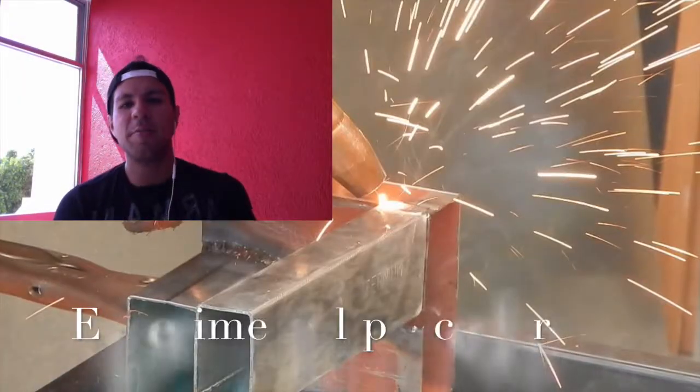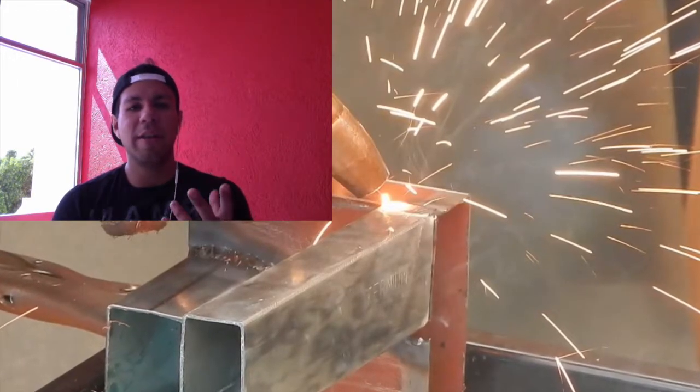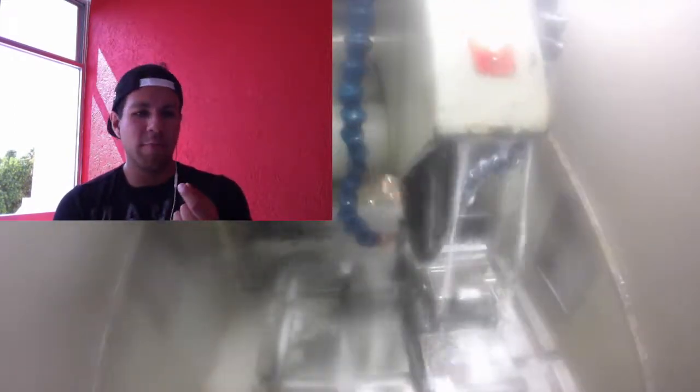The objective of this practice is to analyze the microstructural changes of the welded steel through all the different zones of the welded bead. The experimental procedure consists first of welding two steel plates with microwire. After that, they were cut with the disc machine into two samples, one of the welded steel and the other without welding.